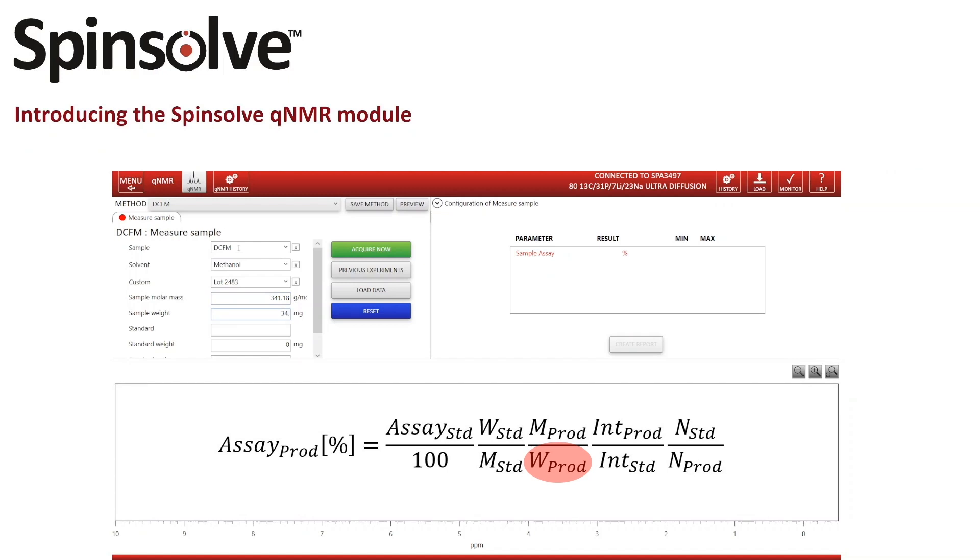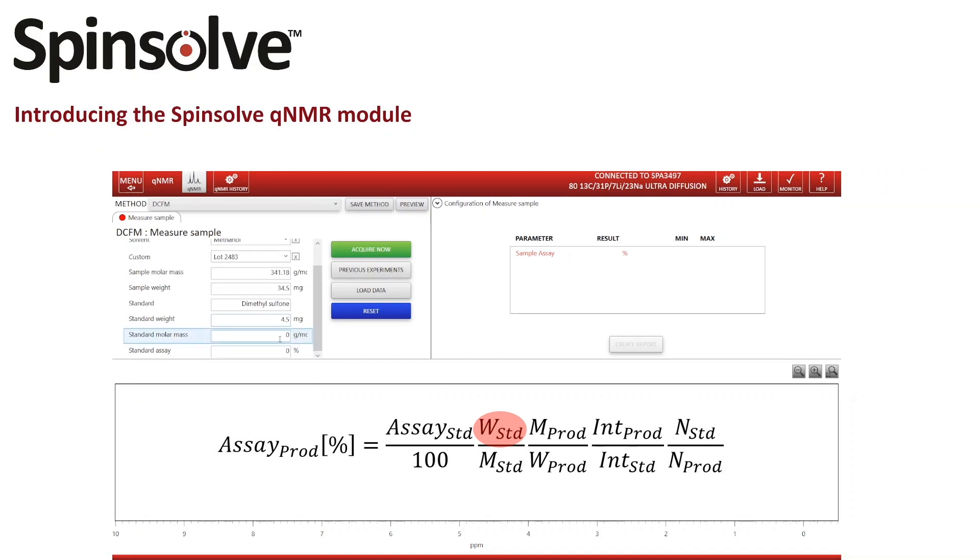I also enter the name of the standard, the amount of standard which was used, the molar mass of the standard, and the assay of the standard.